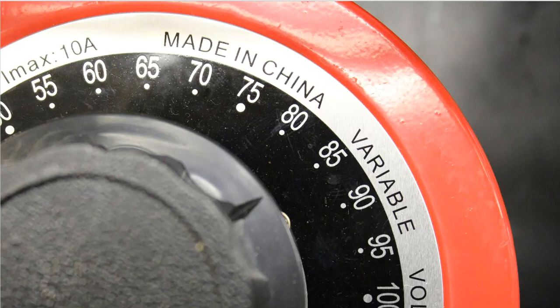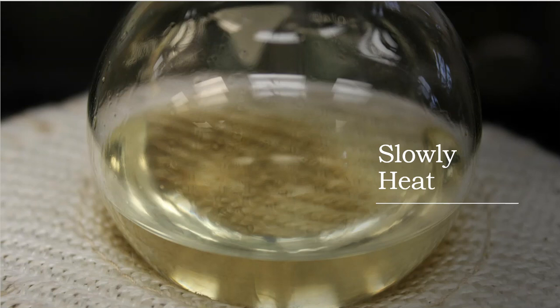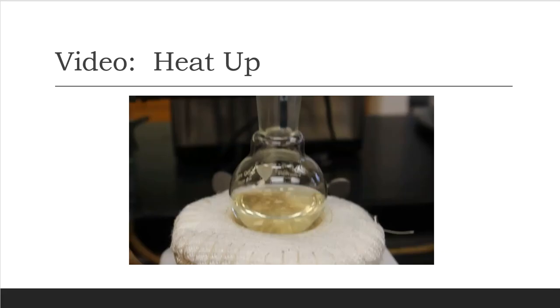Okay, so I'm going to go to the variac. I'm going to turn it on and crank it up to about 85 on the meter. Then this boiling flask is going to slowly heat up over time. Again, you can make your observations before we have distilled anything over at all, and then you can make some observations after we distill everything over that needs to go over. So in this video, you're going to see this setup, and you're going to see live action of the distillation getting heated at this point.